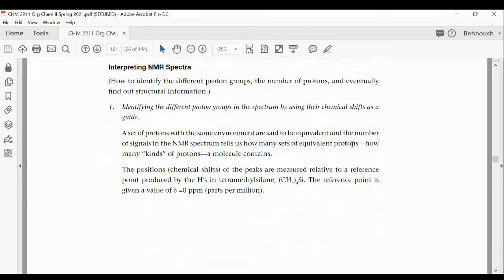It can help to determine the structural formula of the compound, because if you know the functional group and the molar mass, those are two major pieces of the puzzle that you can put together in order to find out the structural formula for your unknown.